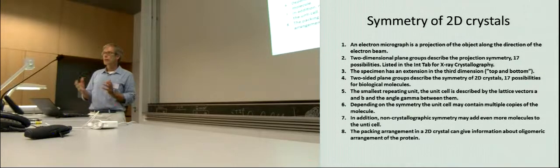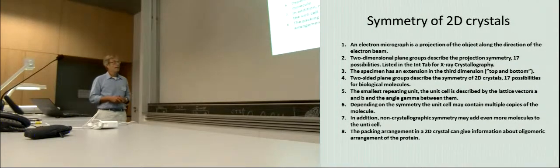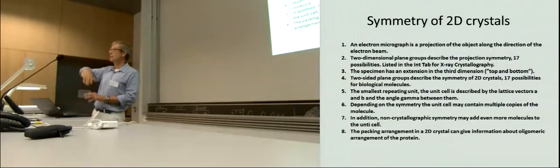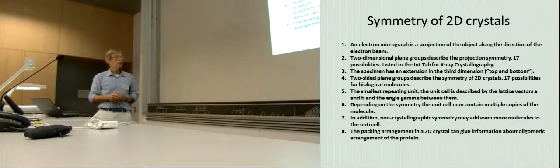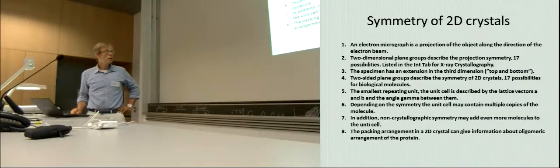So if you use that as a figure, you can determine the corresponding oligomeric size which fits to that packing density. Of course, if you have something very large sticking out, then it doesn't hold anymore. But for small membrane proteins, the packing density is normally 20 to 30 Dalton per square angstrom.